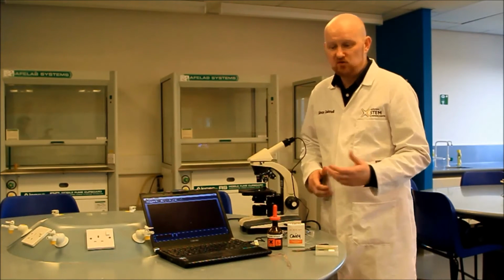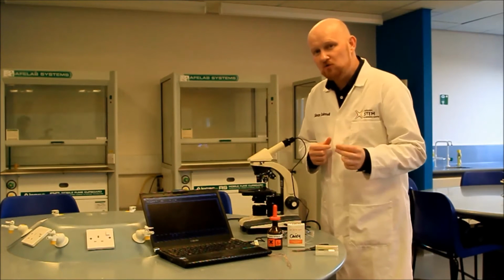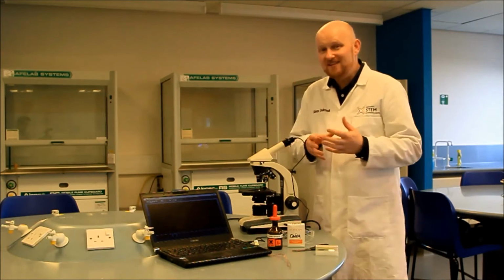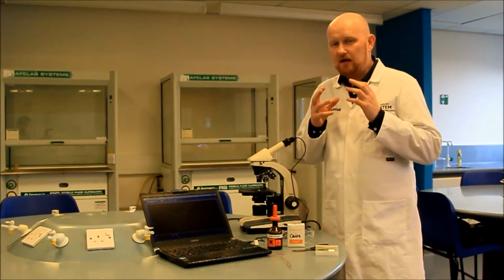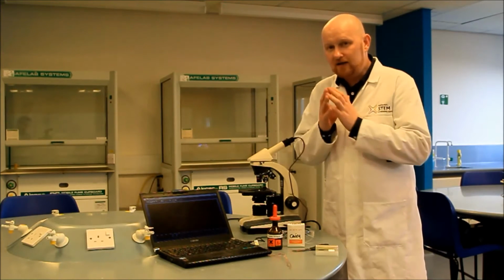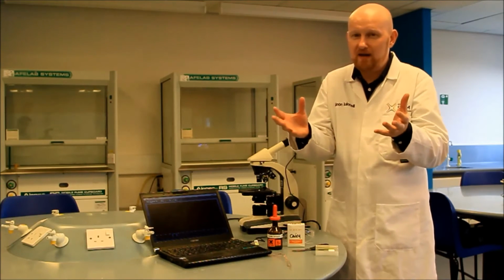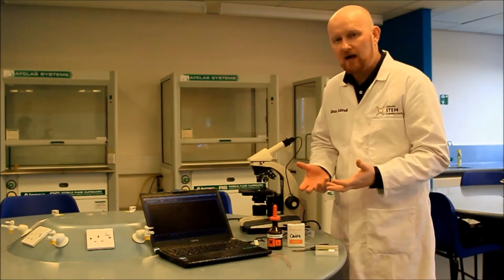Now, this chemistry demonstration is a displacement reaction, and we're going to do that in a microscale way on a microscope. This means we're using very small amounts, so it could be done quite safely by students themselves. It's a lovely reaction, ideal for Christmas because we'll see lots of little crystal trees growing, which inspires a winter wonderland and a lovely landscape.